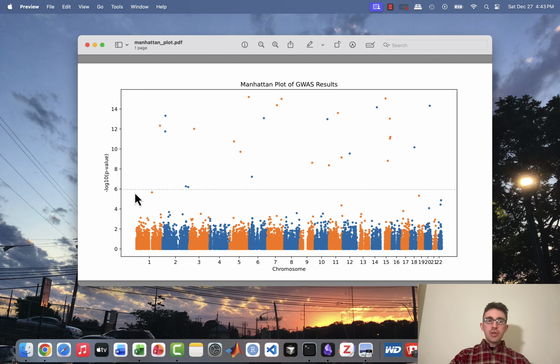And then we're also showing a dashed line here, which is the significance threshold after the Bonferroni correction. So to whatever degree we care about this binary significance threshold, we can see which SNPs fell above this threshold and which fell below. And of course, the vast majority of them fell below the significance threshold. But we can see the ones that fell above it, and then we can trace down to see what chromosome they were on. And so that's kind of the idea.